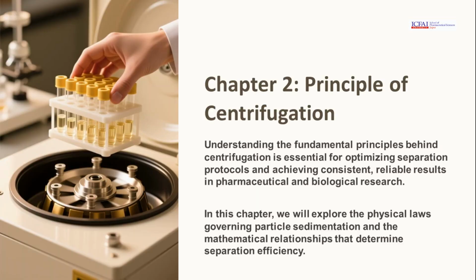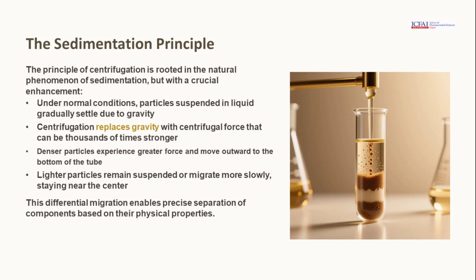Understanding the fundamental principles behind centrifugation is essential for optimizing separation protocols and achieving consistent, reliable results in pharmaceutical and biological research. In this chapter, we will explore the physical laws governing particle sedimentation and the mathematical relationships that determine separation efficiency. The principle of centrifugation is rooted in the natural phenomenon of sedimentation, but with a crucial enhancement.